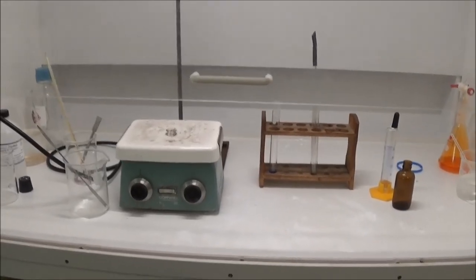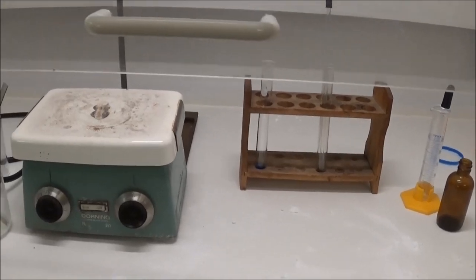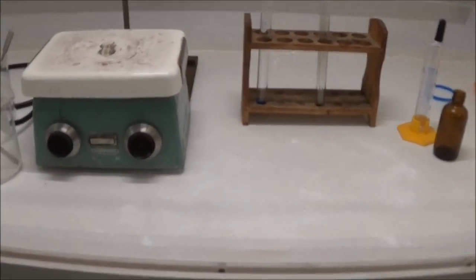Like I said, I did some testing. I set off a huge smoke bomb in here. And there was only a small amount of leakage, like I said, around the upper corners, but after adding the duct tape, that didn't happen anymore.